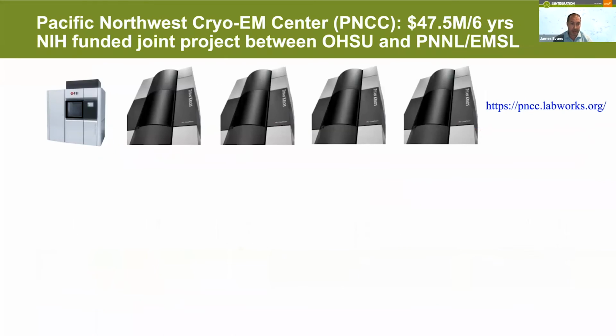Now, in addition to this, Steve Reichow in his talk earlier mentioned the Pacific Northwest Cryo-EM Center. This is a joint project between Oregon Health Sciences University and us, PNNL and EMSL, in order to build and operate a national center for cryo-EM. So this is also an available approach for anyone.